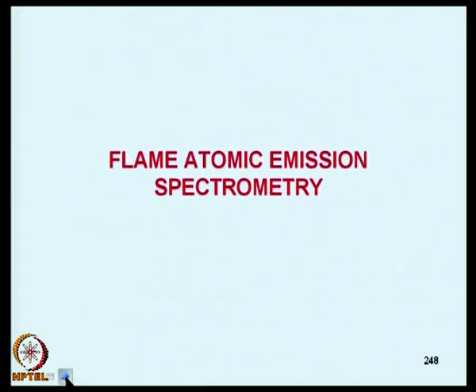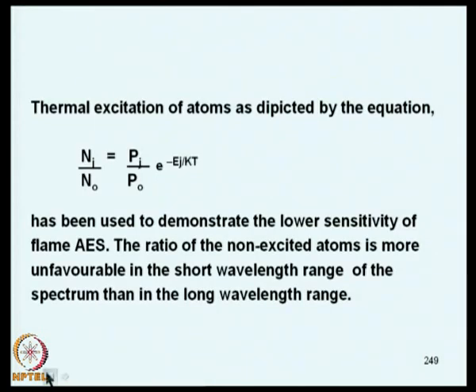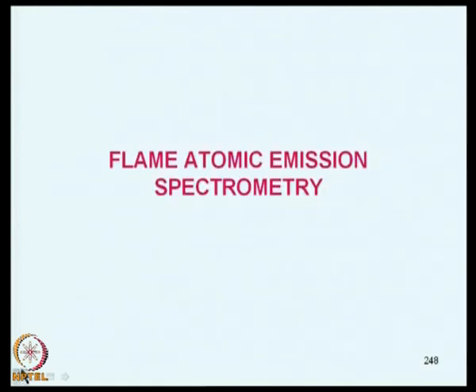Now, we will turn to another aspect, flame atomic emission spectrometry. Why I have included this topic at this stage is that earlier we had discussed fluorescence analysis and X-ray emission.